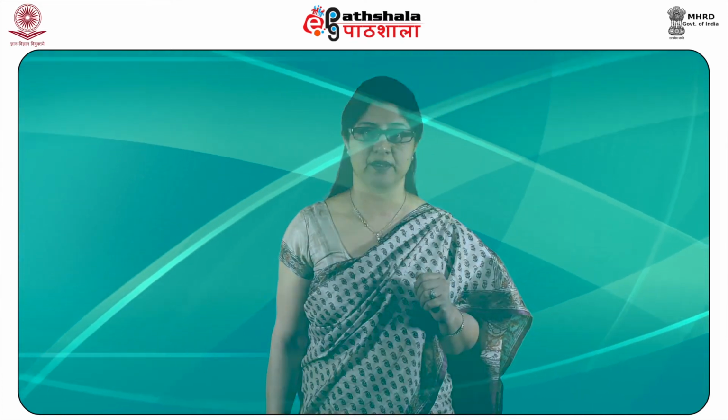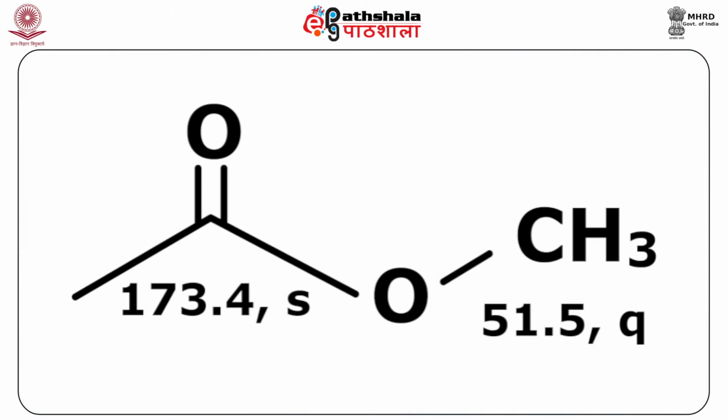The presence of the carbonyl group is confirmed by the peak at 173.4 in carbon-13 NMR. Thus, it accounts for the only double bond present. From carbon-13 NMR, it is concluded that the peak at 173.4 is for the carbon attached to no hydrogen, which is a carbonyl group, and 51.5 is for the carbon attached to 3 hydrogens, which is CH3. Therefore, these two peaks together indicate the presence of the structure C double bond O, O CH3.